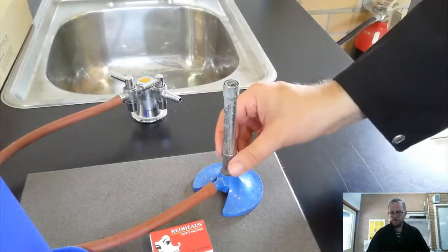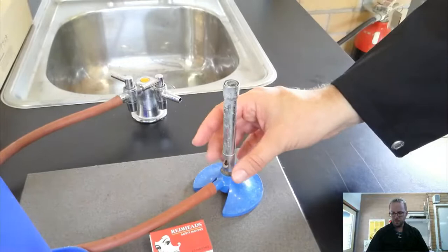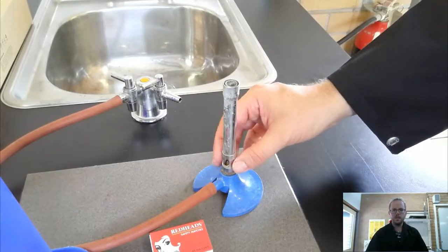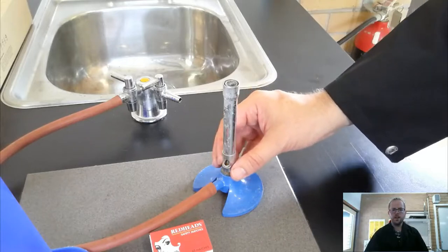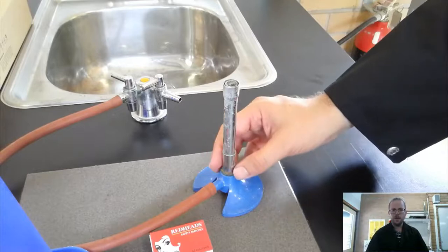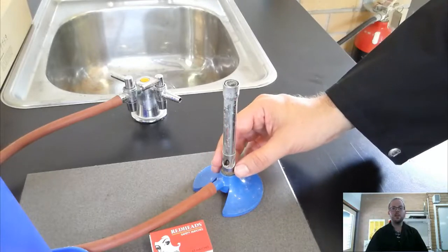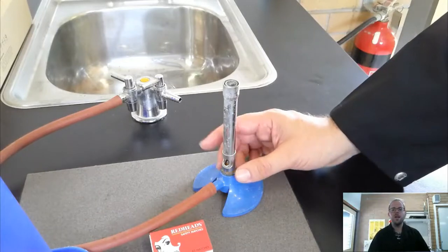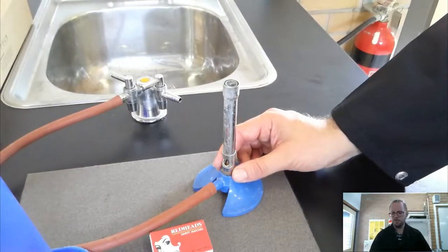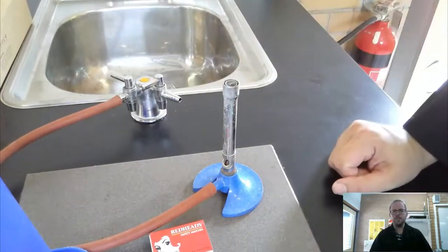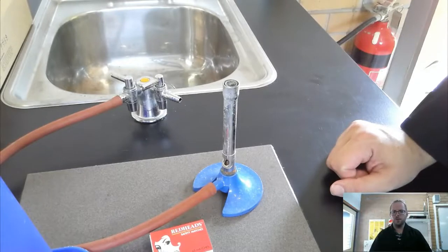We've got a couple of other bits of equipment that I can show you, or some features of the Bunsen burner. I've got what's called a collar down here, this little piece of metal that can slide, and it's got a little hole that closes and opens depending on how I spin that collar. That's going to become important because it allows us to control the type of flame that our Bunsen burner is producing. We've got our base, and that's pretty much it. It's a very simple piece of equipment, but it works very, very well.